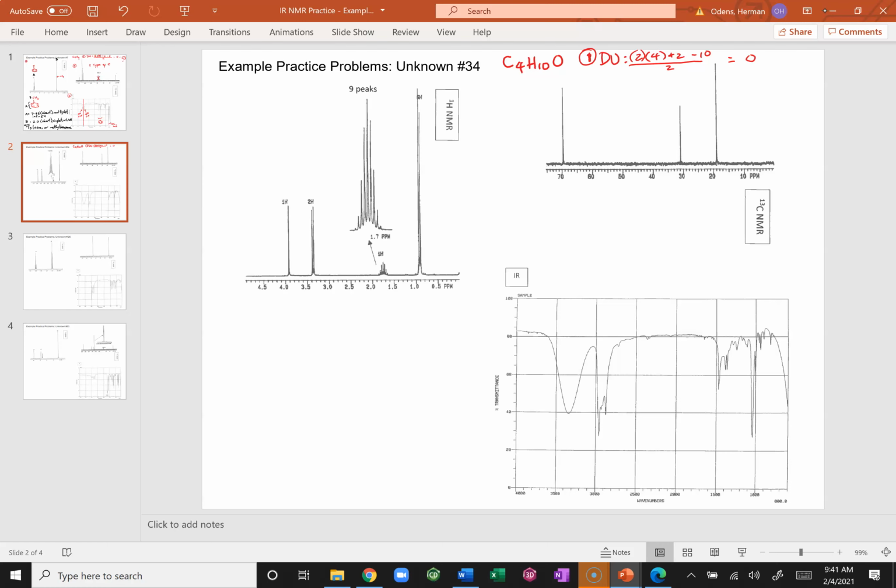All right. I don't memorize these spectra, so they're blank. I don't even have a key, so I like to solve them every year just to keep my mind sharp. So 1, 2, 3. The next thing I'm going to do is find my types of carbons. I have 3 types of unique carbons.